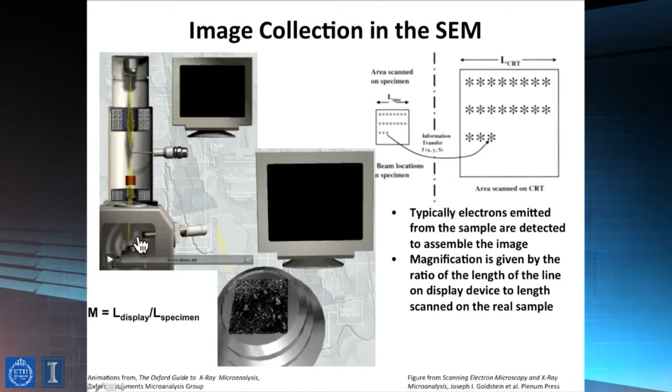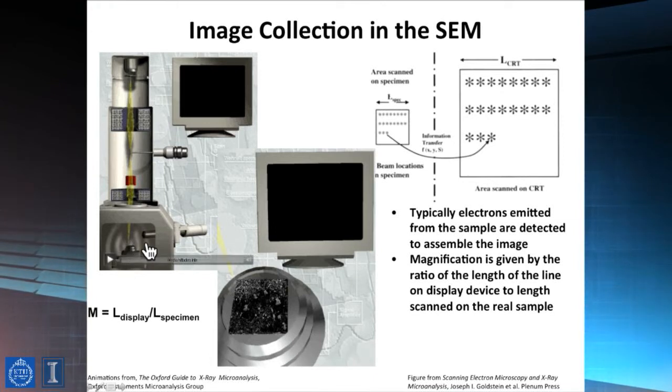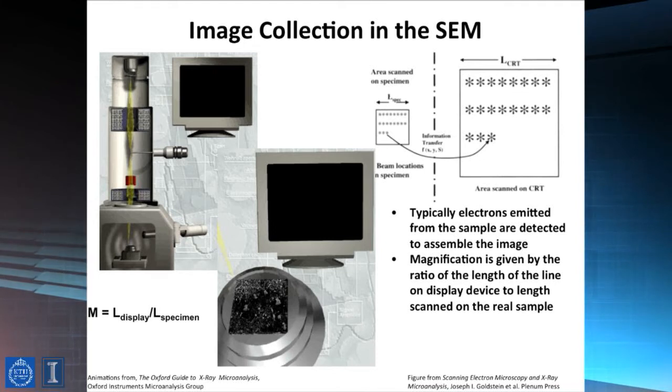And because we're not doing surface analytical spectroscopy, the vacuum environments that are used here can in fact be relatively less demanding than is true of techniques such as XPS or AES. They can be high vacuum environments, to the order of 10 to the minus 5, 10 to the minus 6 torr, which are perfectly adequate for these kinds of features.